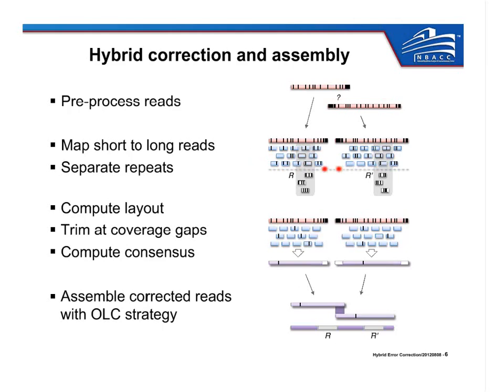Once we have all of these alignments of the short reads to the PacBio reads, we can look at the depth of coverage, so how many short reads are aligning to each spot on a PacBio read. In cases where that depth looks unusually high, we have some statistics to determine whether we're looking at a unique region of the genome or a repetitive region. And we try to make a decision there to separate out any repetitive copies. So if I have a 2-copy repeat here, R and R prime, I have twice the depth of coverage in each of these reads on that repeat, because the reads from this one also map to the repeat over here, and the reads from this one also map to the repeat over here.